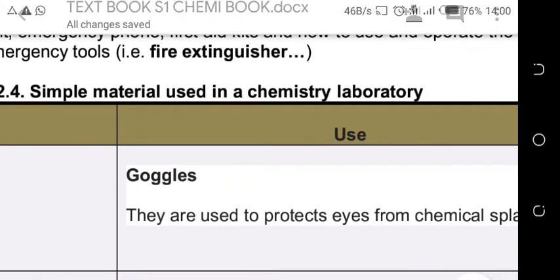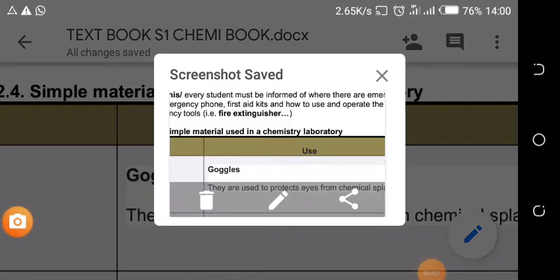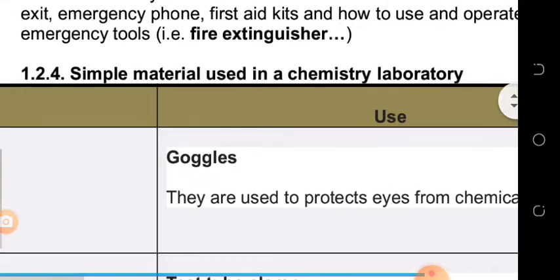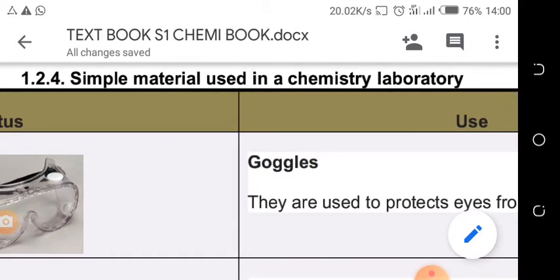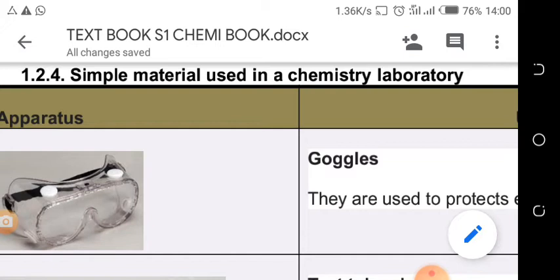Again, we are going to start the explanation, and again it is O-level notes or A-level skills about laboratory simple materials. I'm also still Johnson RUTERANA, a teacher of chemistry, and sample of laboratory equipments, mostly apparatus, which are normally used.